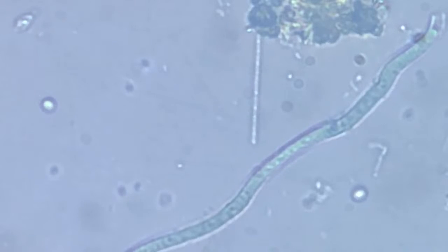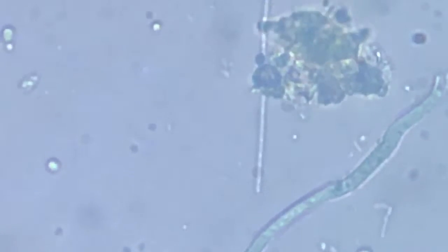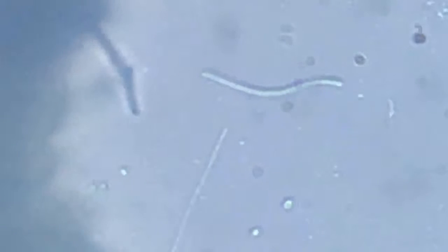Okay, now we trace it to the tip, straight, slight bend towards the right, but still largely straight like a highway. This is a crazy thing. I haven't seen anything like this before and have no clue as to what it could be.